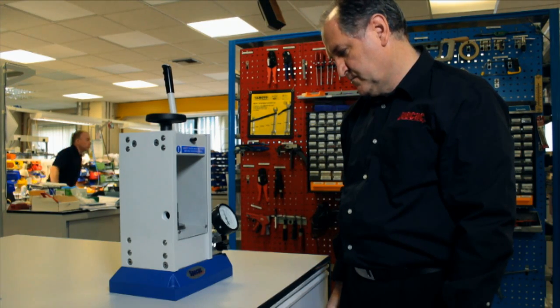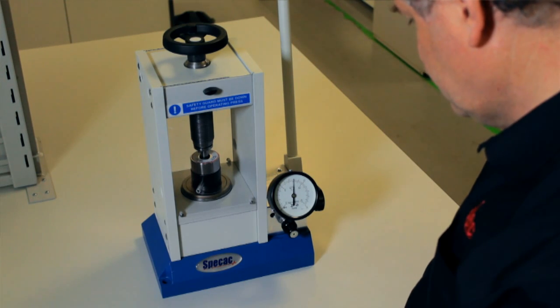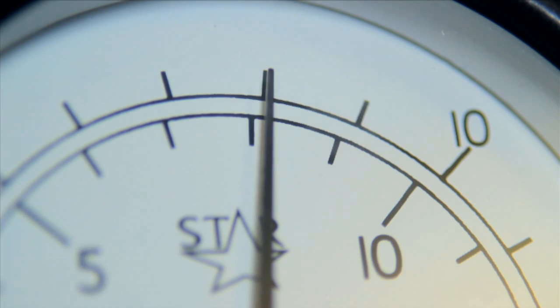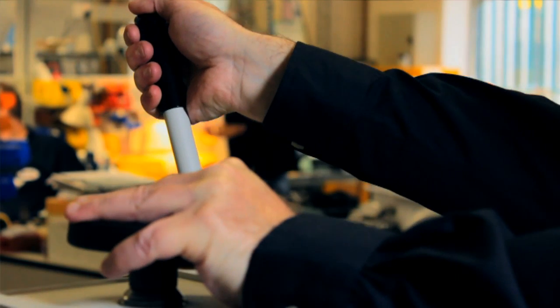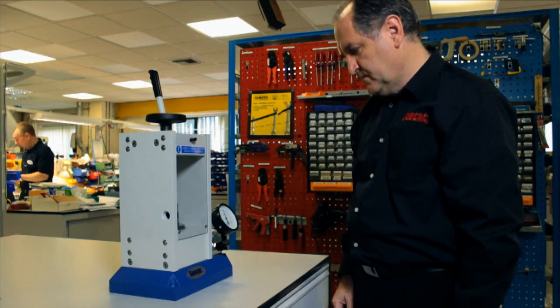The tonnage load and pressure of oil in the system can be held for as long as required. You may observe a slight decrease in the tonnage load indicated at the load gauge as the oil pressure decreases and the work being pressed relaxes over time. You can bring the oil pressure back up to the required tonnage load by pulling gently on the pump handle grip further.